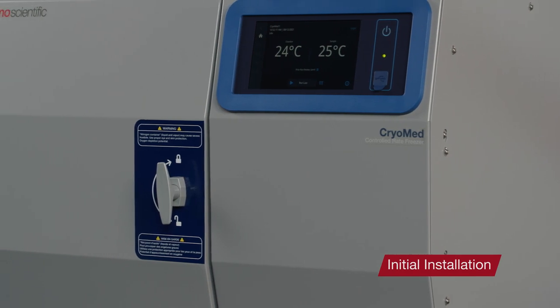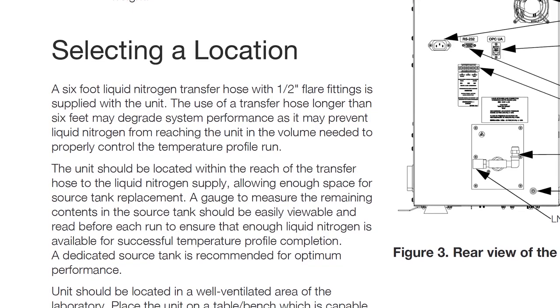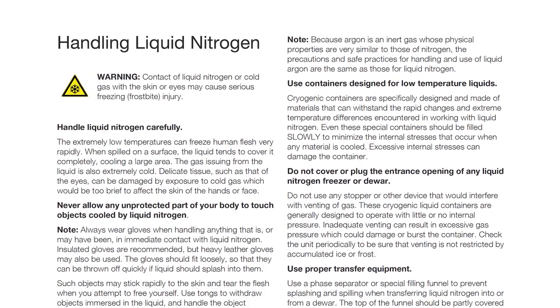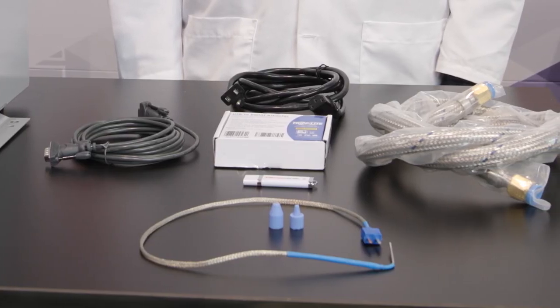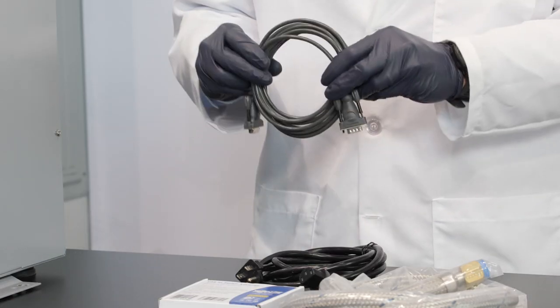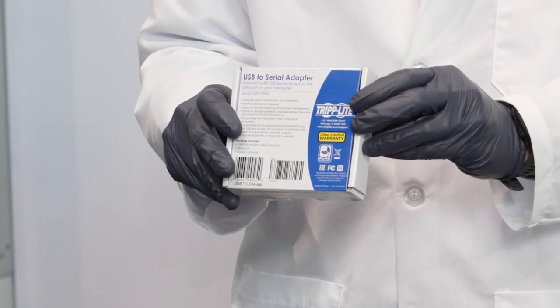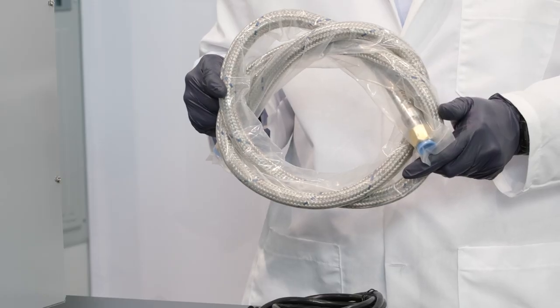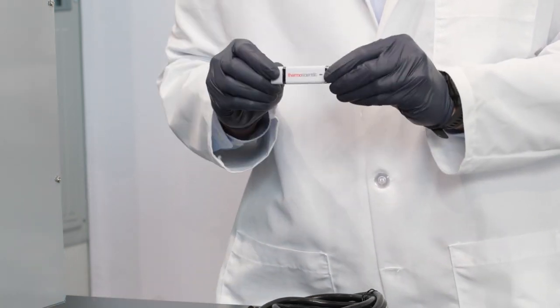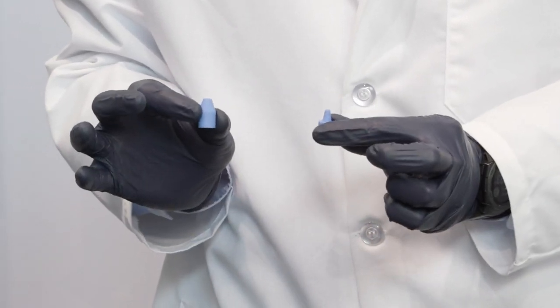Prior to the initial installation, please refer to the user manual warnings and information regarding the location of your unit and the use of LN2 in your laboratory. Check and make sure that the following accessories were included in the shipment: power cord, an RS-232 serial communication cable, an RS-232 to USB adapter, a six-foot long LN2 transfer hose, a USB containing the user manual and PC interface software, sample thermocouple probe, and two ampoule stoppers.